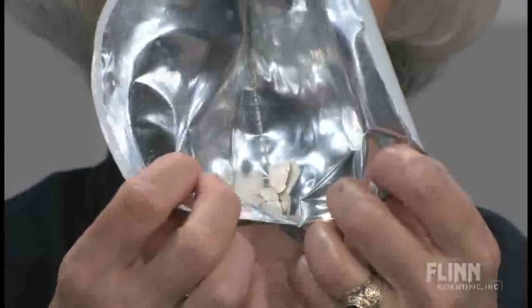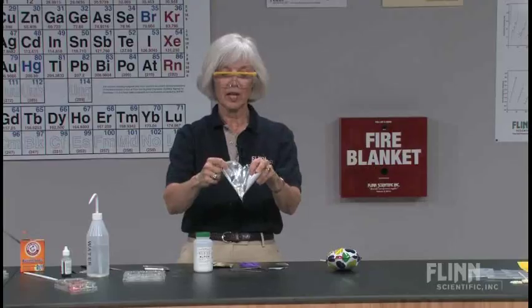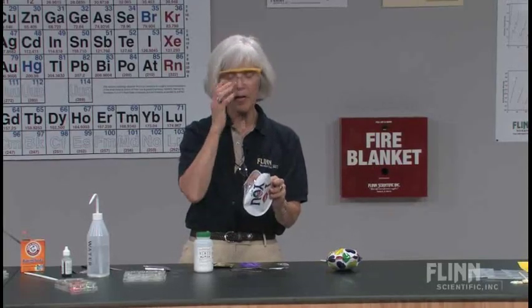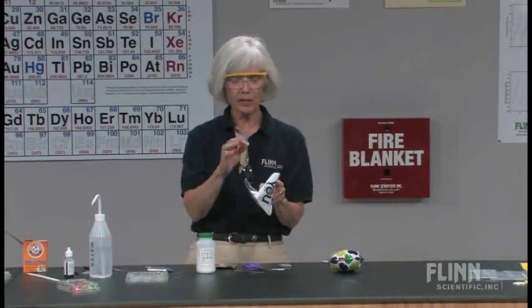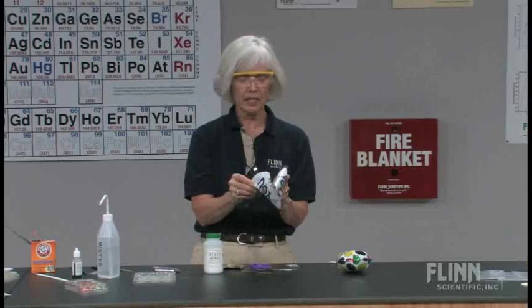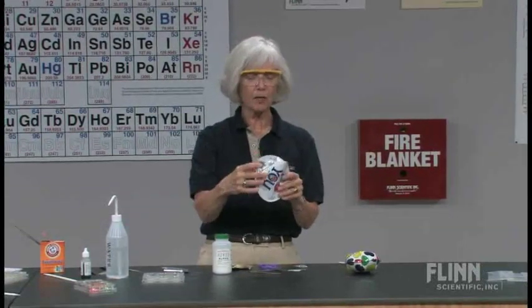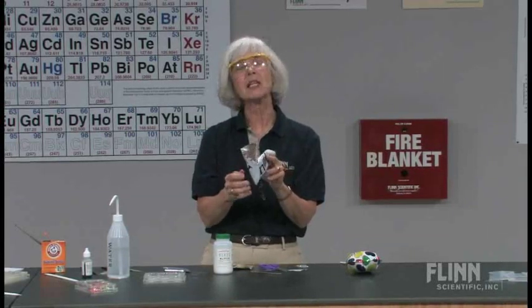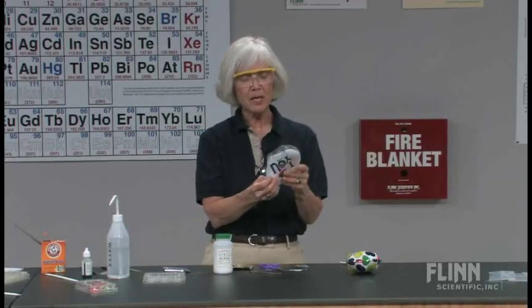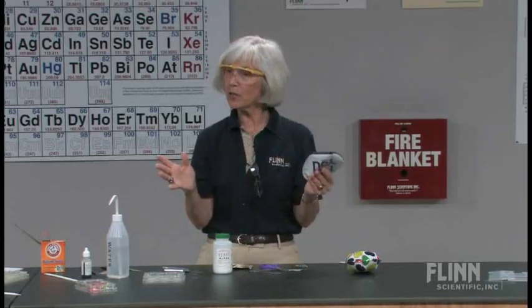So, with my second year students now, they're going to have to do some stoichiometry. And what I do, first of all, is have them analyze to see what's where. And that is, again, they discover that, yes, that is baking soda, and yes, that is citric acid in the magic water. But then they take a fresh balloon, and they measure the baking soda mass. And they measure the volume of the balloon after they've cut it open. And they do some stoichiometry.